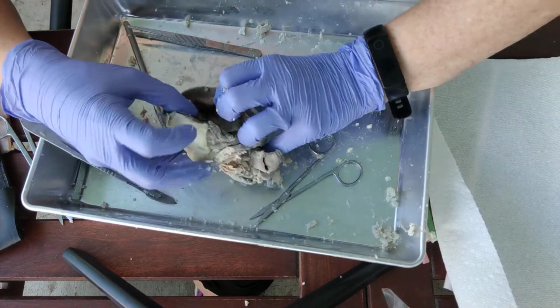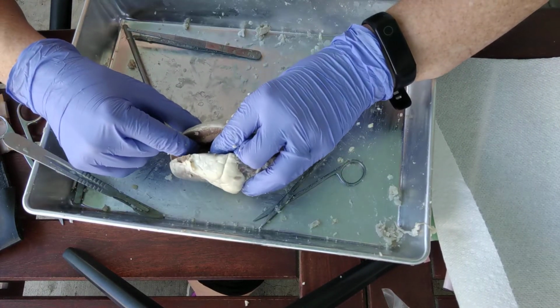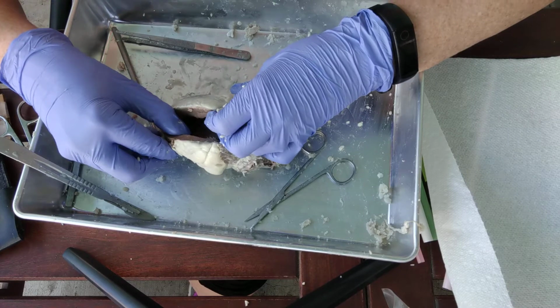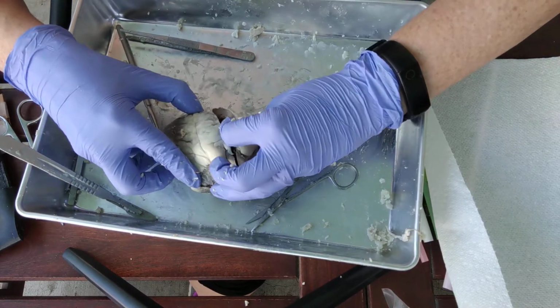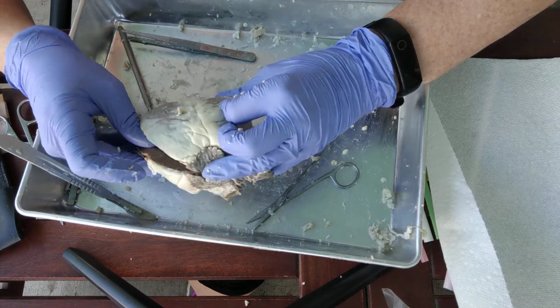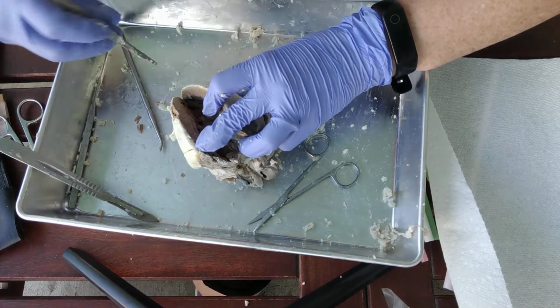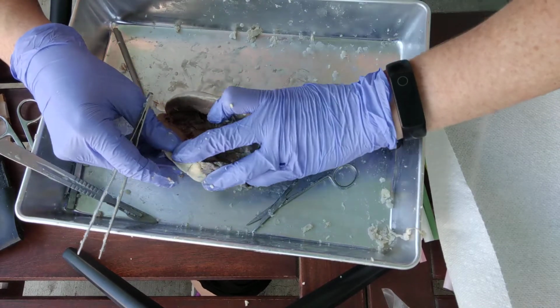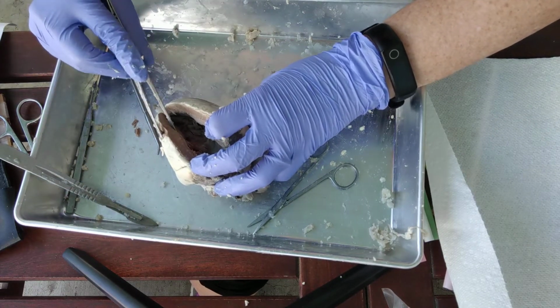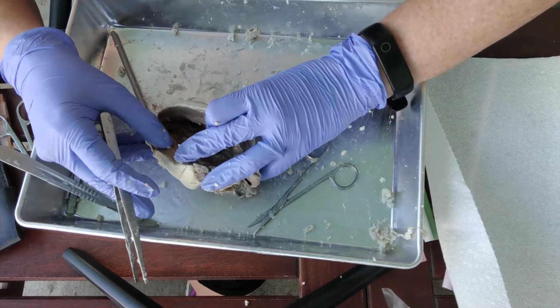Okay, so the first thing I want to do is go ahead and take a look at how thick this wall is. Okay, so the left ventricle has to pump through the aorta all the way to the whole body. So it's going to have a significantly thicker wall than the right ventricle. Okay, look at the difference. So if you see a thick wall, that's going to mean you're in the left ventricle. And that's going to help with identifying this little valve here. Okay, so I look in and I see some little cusp with some strings. I know it's one of the AV valves. I know that I'm in the left ventricle, and therefore this must be the bicuspid valve.